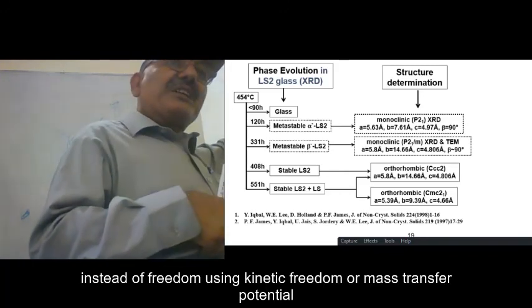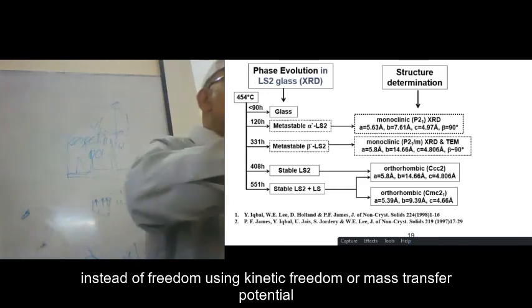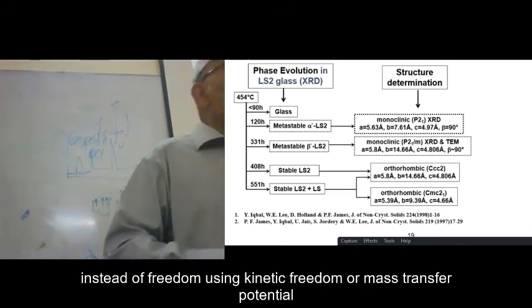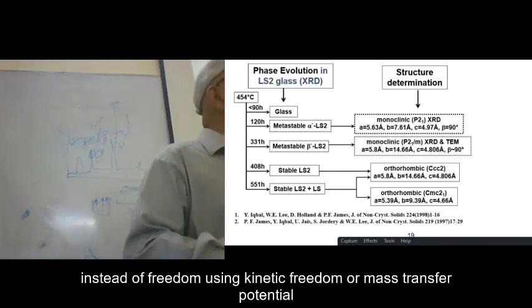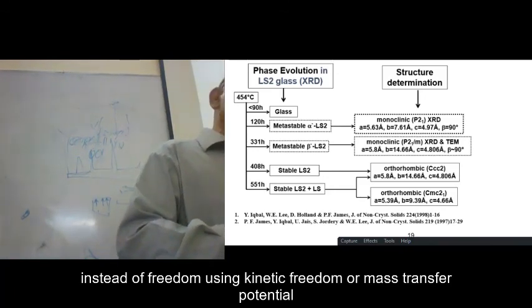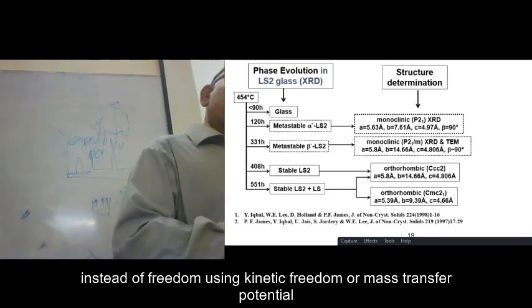I melted the material, cleaned it, ground it so that both the surfaces were shiny. Then I heated it for this long time.